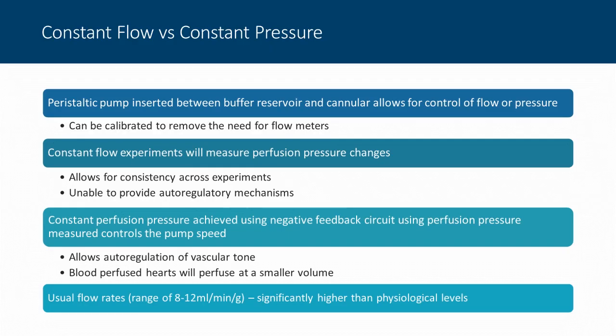Constant flow setup is particularly useful for low flow models of ischemia and also pharmacological studies. Constant flow allows for really good consistency across experiments. However, we do see that it won't allow for changes in perfusate flow rate to allow for autoregulatory mechanisms.